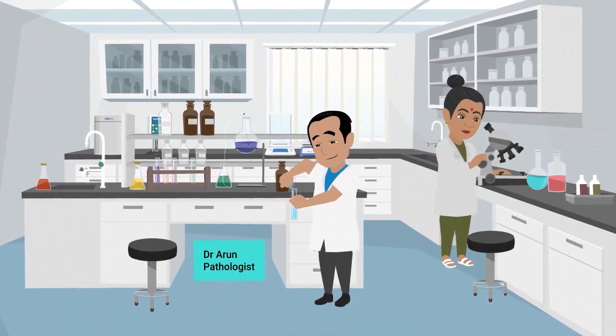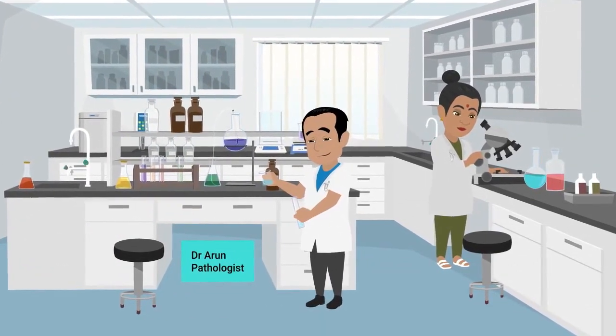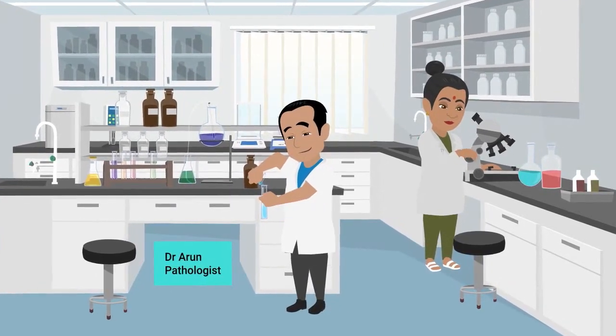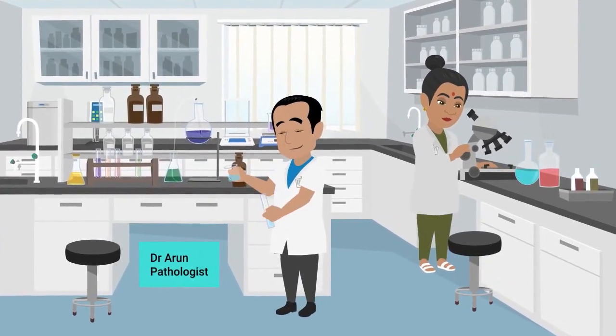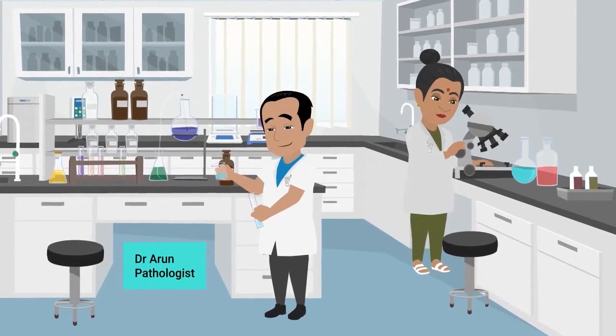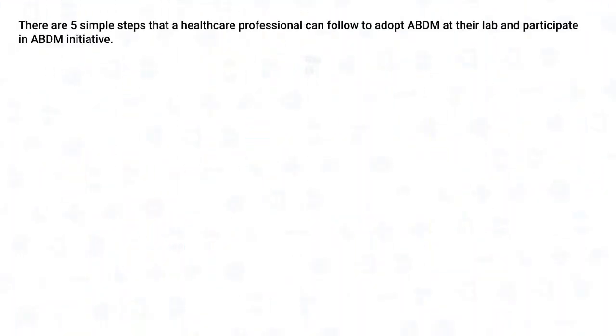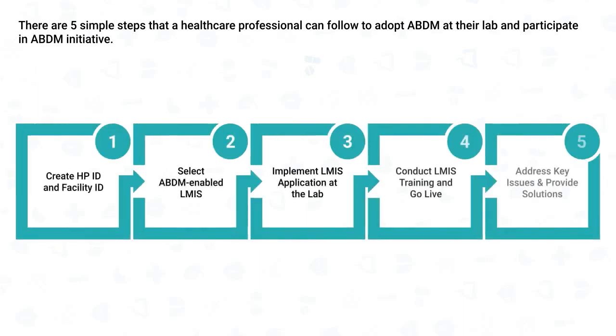Meet Dr. Arun, a pathologist who owns a laboratory. He does not have a Lab Management Information System, LMIS. He recently learned about the ABDM and is excited to participate. Let's now understand how Dr. Arun and other lab owners or administrators can adopt ABDM at their labs and participate in ABDM initiative by following 5 simple steps.